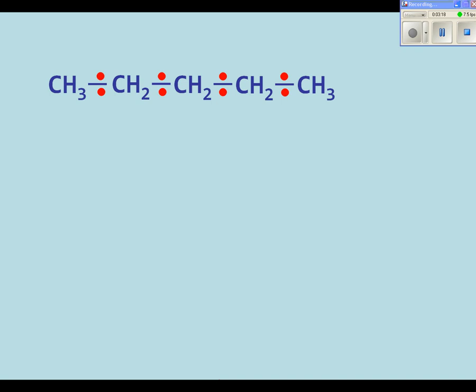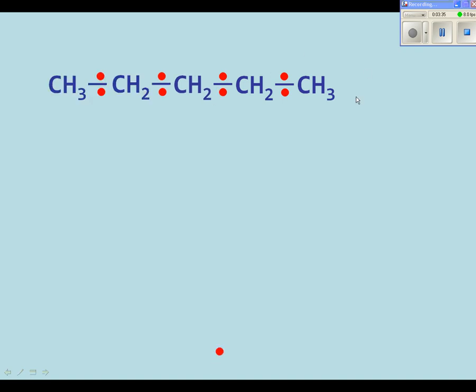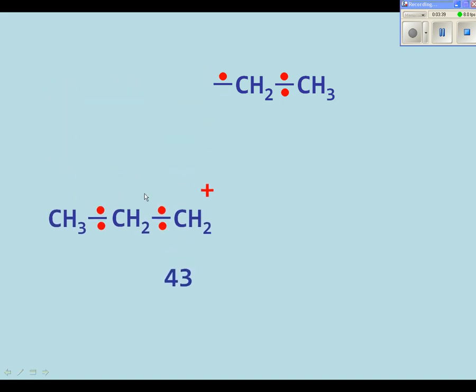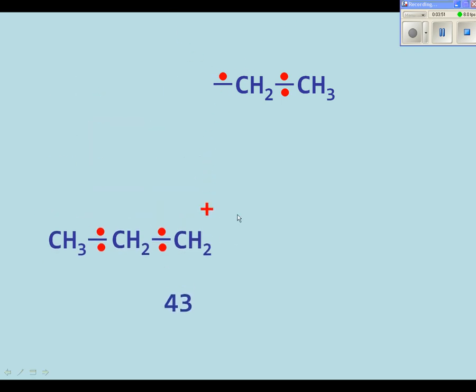Now, alternatively, electron bombardment could occur at another point in the molecule. In this case, it'd be the second bond down the chain, causing fragmentation. If the electron remains behind with the ethyl group, then as we saw, a propyl fragment ion would form, and the propyl fragment ion would then move into the next part of the mass spectrometer and eventually be detected on the detector.